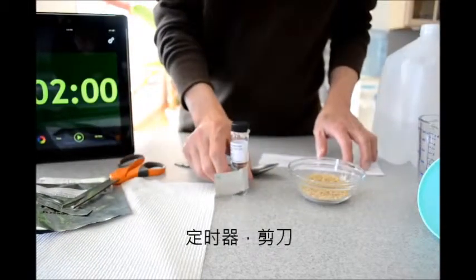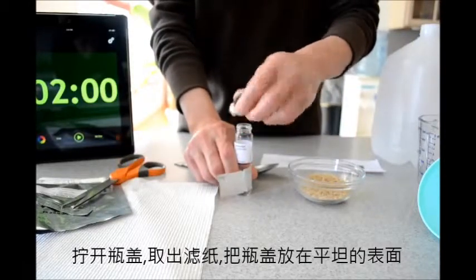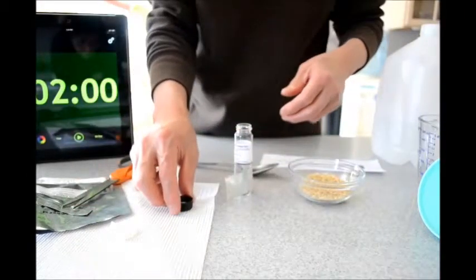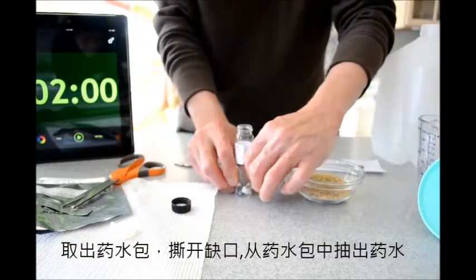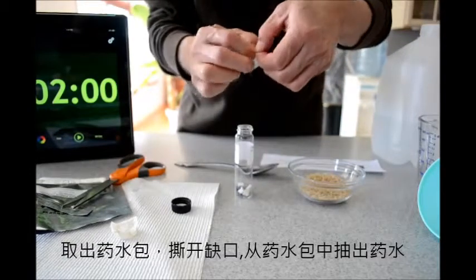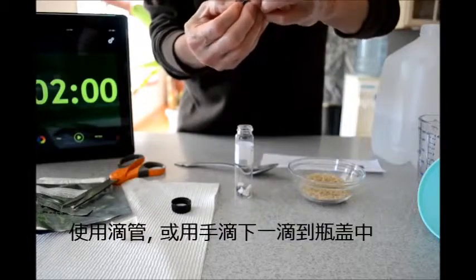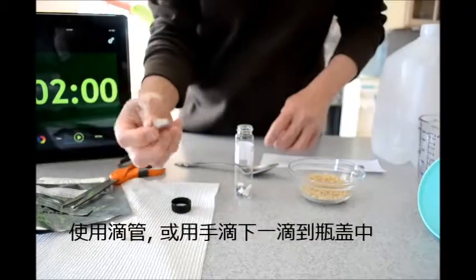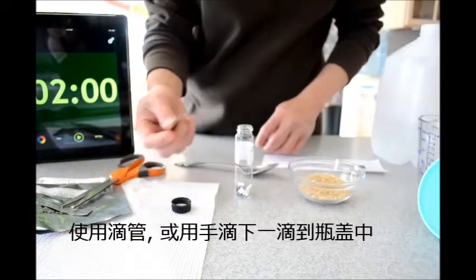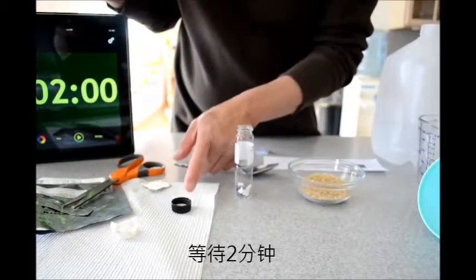Let's begin by preparing the detector for use. I'm going to unscrew the top off, take the filter paper that's there, set it aside. Take the solution pack it out — there is a notch here, I can just open it; be careful not to spill any drops. I will put one drop into the cap.